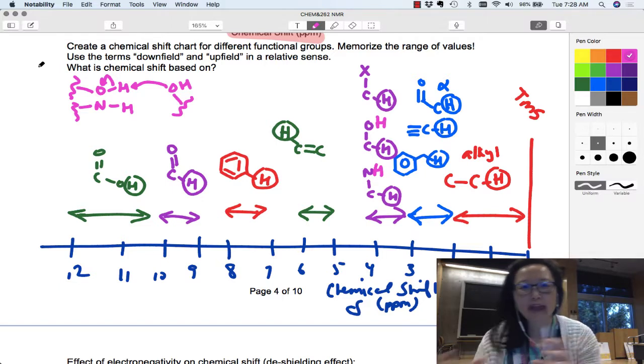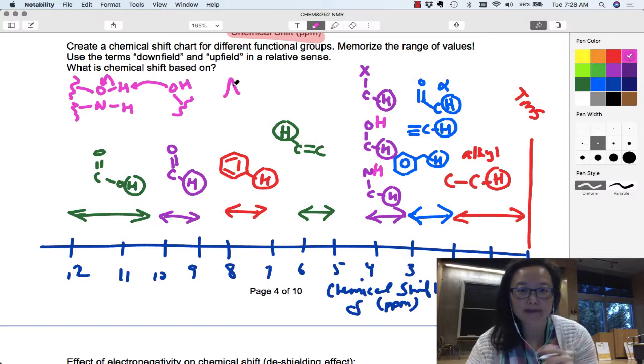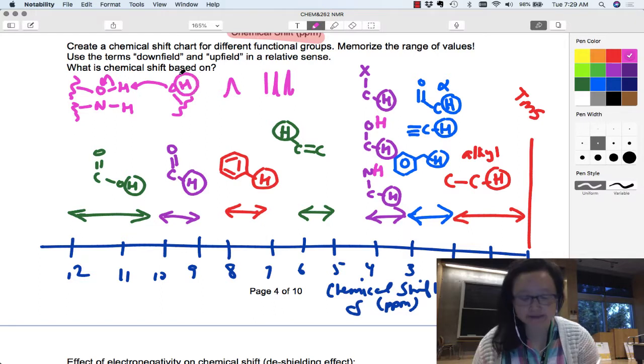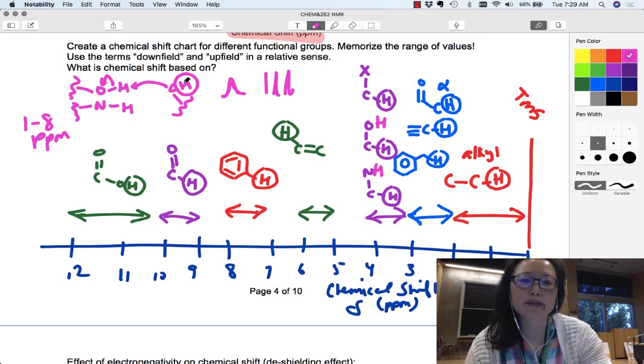So because of that, we generally see a variability in where they show up, and oftentimes they show up as a single peak that's sort of broad. The other peaks tend to be really skinny, like this, okay? And so these exchangeable hydrogens tend to be a little bit more broad, and they occur randomly between, let's say, 1 to 8 ppm. You usually see sort of a peak like this, corresponding to that hydrogen.